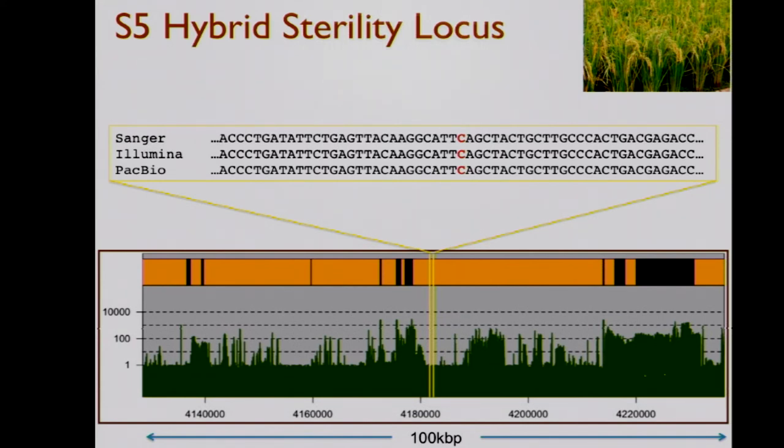So in this plot, I've tried to estimate the copy number of the genome using that k-mer counting approach. The main observation is that these regions where we had gaps in the Illumina coverage, where we just had no contigs, all corresponded to regions of, in this case, like 100x. These are repetitive elements that occur like 100 times in the genome, just really poorly assembled. In fact, they assembled so poorly that the assembler totally left them out of the output. As a practical thing, ALLPATHS won't report contigs that are shorter than about 1,000 base pairs. So the sequence that should have gone there was in one of these auxiliary files that you don't even ever look at.